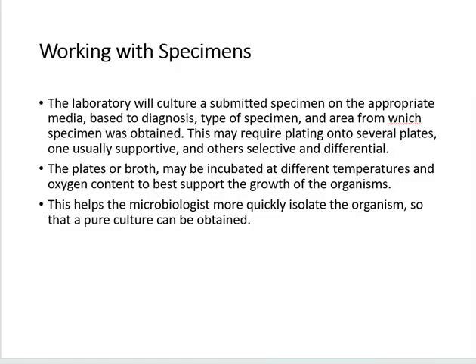So there are many different ways that we can do this, and this helps us, one, support the growth of that organism, and two, more quickly isolate the organism so that we can get a pure culture and then get the results to the doctor faster.